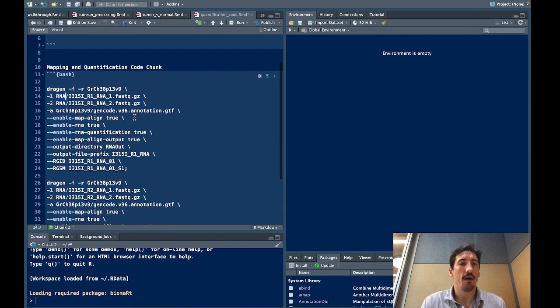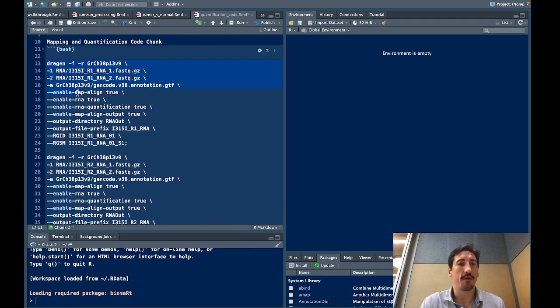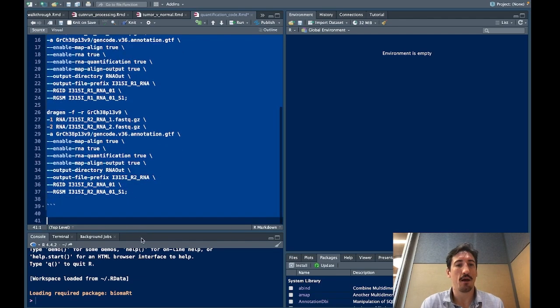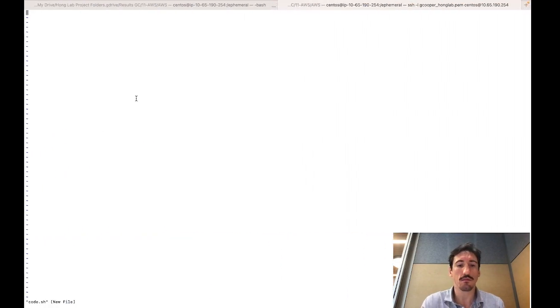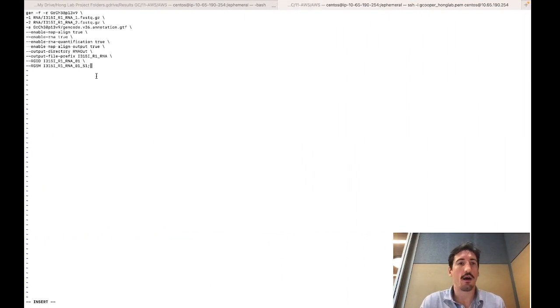And so then I'm going to come over here and copy these commands that I have pre-made to align the two. I'm just going to do this one because we only brought in these two files. Another thing I've noticed when copying this that often catches beginners off: for some reason the first three letters don't copy when you use Vi, so make sure to type in DRA there.